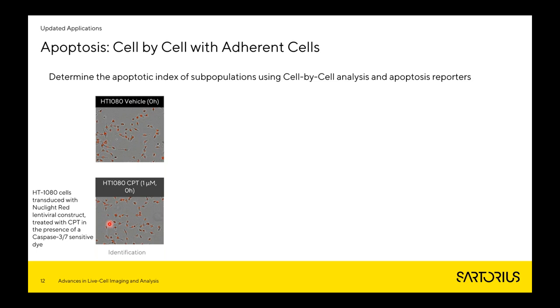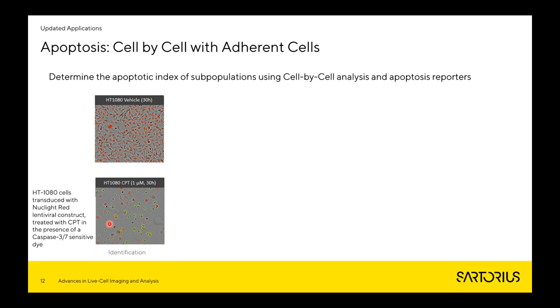In this assay, we have HT1080 fibrosarcoma cells. These have been transduced to express a red nuclear protein, and they've been cultured in the presence of a caspase 3/7-sensitive dye, which gives us a readout when the cells begin to undergo apoptosis. The cells have been treated with either a vehicle control or camptothecin. At 30 hours, the vehicle control cells look very nice and healthy — they've proliferated and formed a confluent layer — whereas the camptothecin-treated cells look very different. We see green fluorescence as they begin to undergo apoptosis, granulation, and cytoplasmic swellings. We can perform cell-by-cell segmentation on these objects and get cell count information.